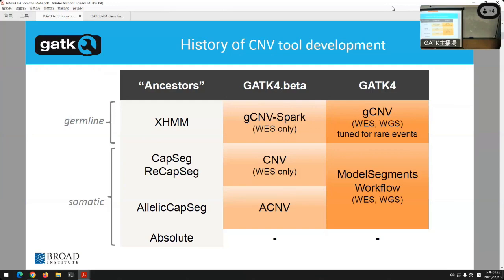What we've shown here, this plot, is how over time we've improved things. At this point, between both the somatic and germline sides, the tools are much, much higher quality. I think Emma will talk to you about some actual clinical cases on the germline side. The germline caller is used in our clinical pipeline for rare diseases, and it's used very effectively. If you ask the researchers, they are very happy with their performance there, whereas if you asked them 3 years ago, they would have said they cannot make copy number calls. So we've really done a great job of improving things.